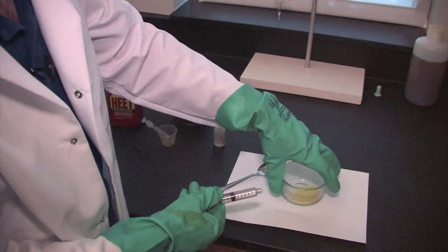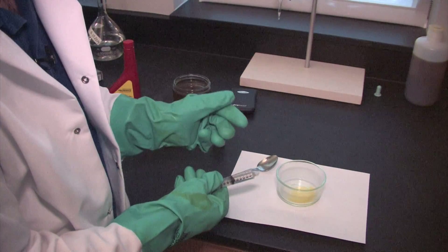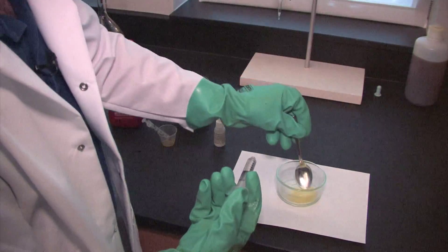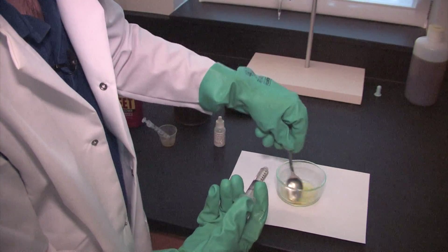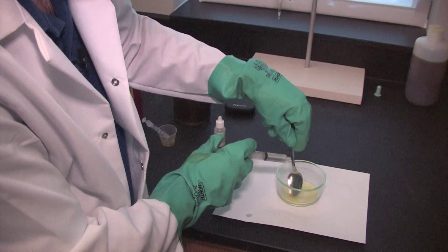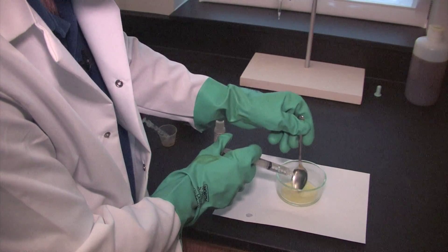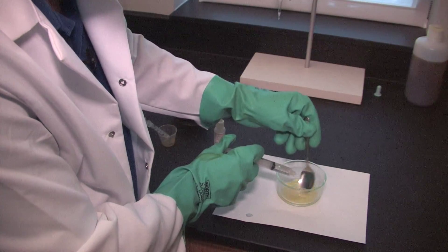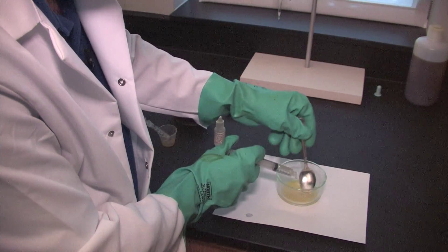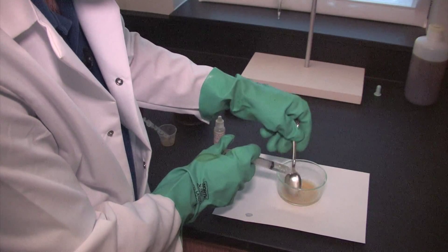I've added a piece of white paper underneath the glass dish to help with seeing the color change. Basically we should see a color change from the yellow caused by the oil — it should change into a light pinkish to red color. We're going to mix this and as we're mixing, slowly add some of that potassium hydroxide solution. You can see some faint pink starting to appear, and it's going to get a little bit darker as we add a little bit more.